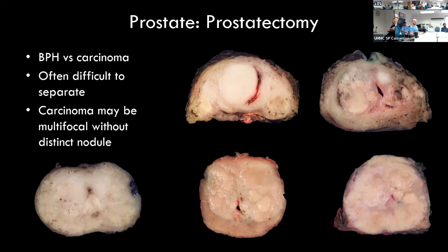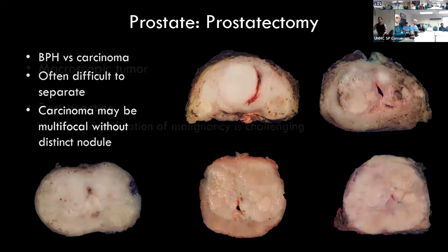Right, so if there's a change in color, it's best to not document it as a single dominant nodule. Because that type of growth assessment will be confusing on microscopy, where we see sections that are separated from each other. So if you're not sure, better to say you're not sure, or say no distinct homogeneous nodule is identified, or something like that. Okay, thank you.